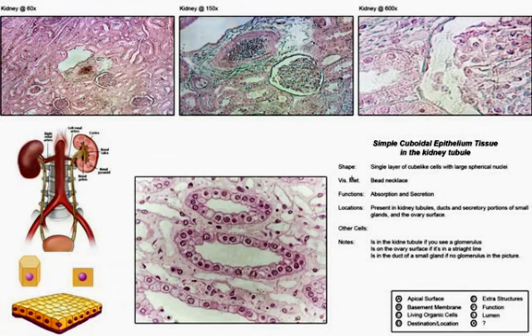Okay, this is also a kidney slide. The same structure shown as just a different view at a different level of the kidney that shows obliquely cut, or an angle cut, kidney tubules that normally are quite circular in nature as they move through that area.